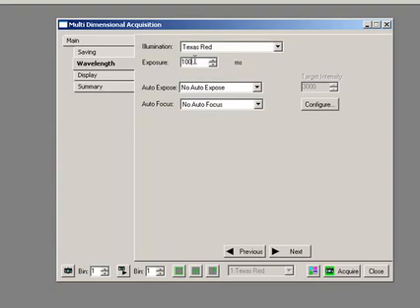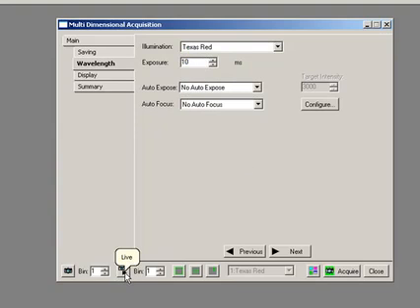I can also set up my exposure time, so I'm just going to say I want to use a 10 millisecond exposure time. And now I want no auto-expose, no auto-focus. How do I look at this image?